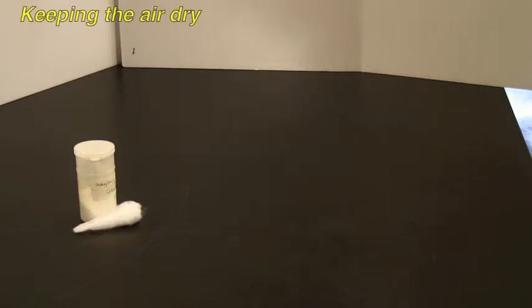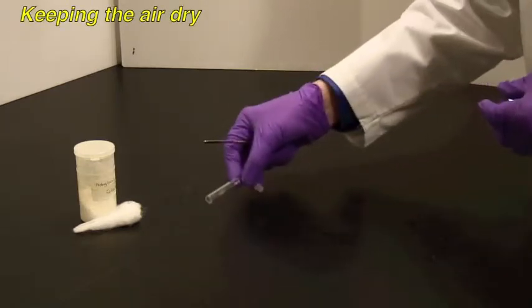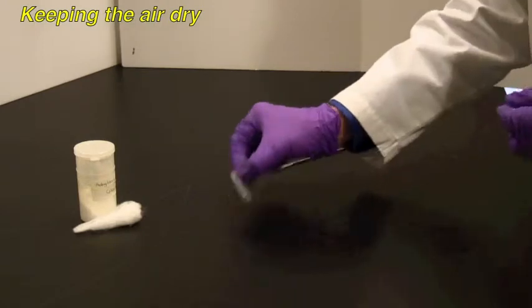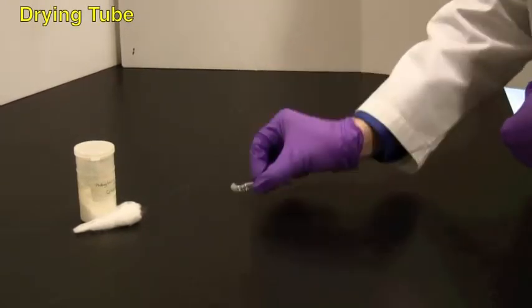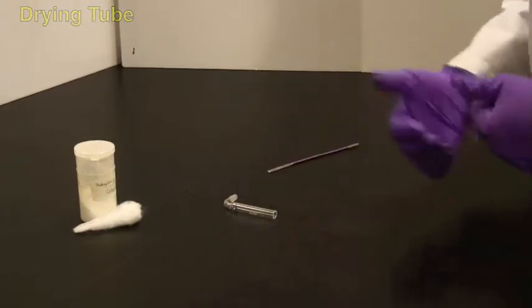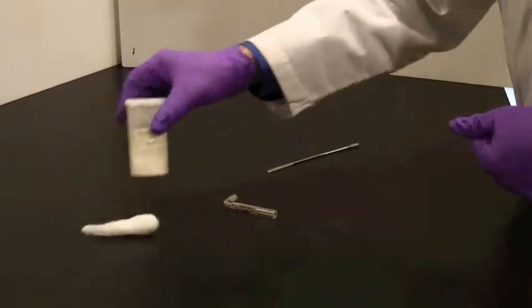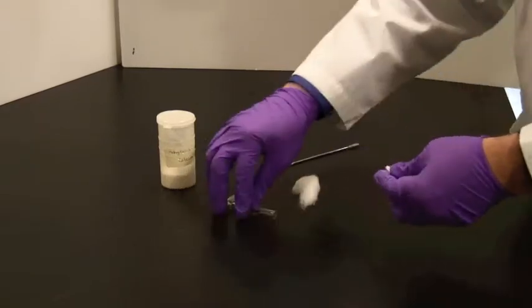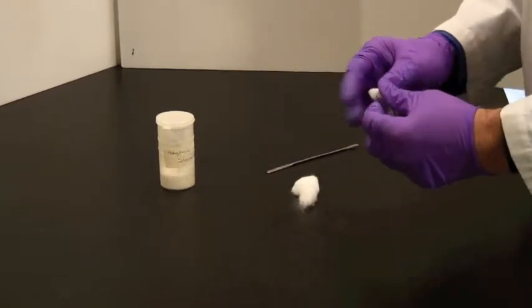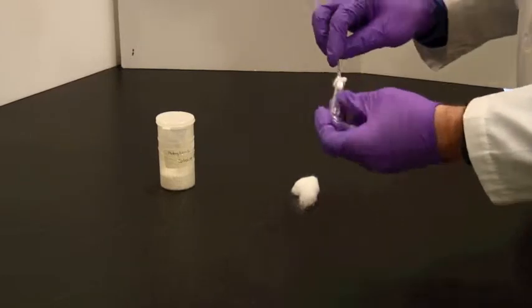The first thing to dry, actually, is the air, and the way to keep the air dry is to use this. It's called, oddly enough, a drying tube. This is the way that air enters your apparatus, and you fill it with an anhydrous salt, which keeps it dry, that is, it removes the moisture from the atmosphere.